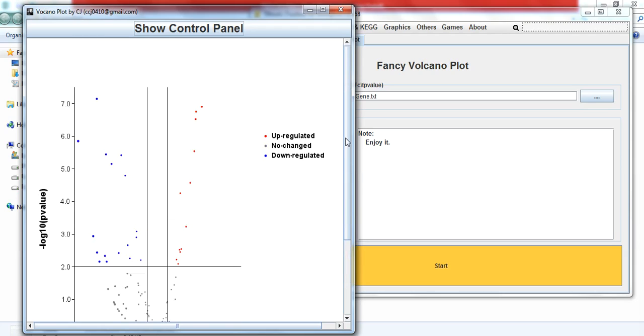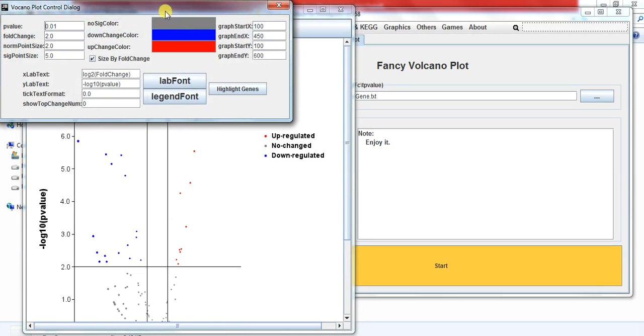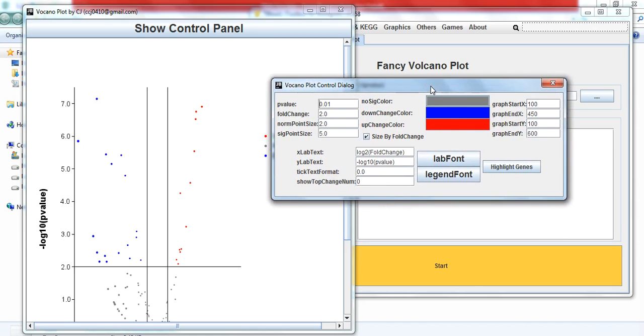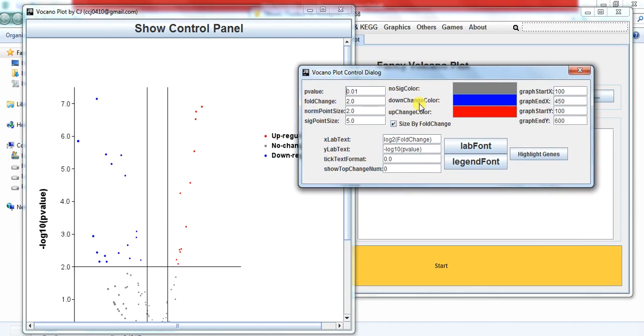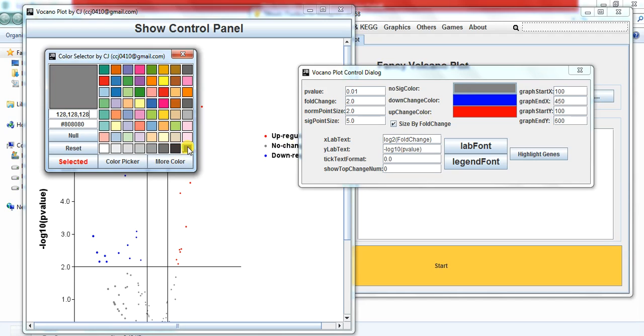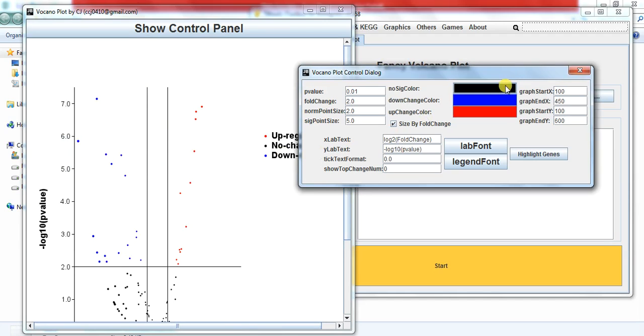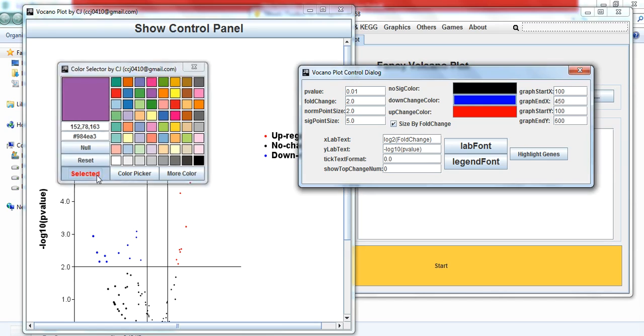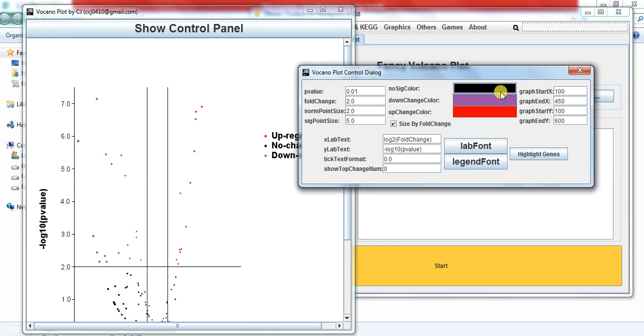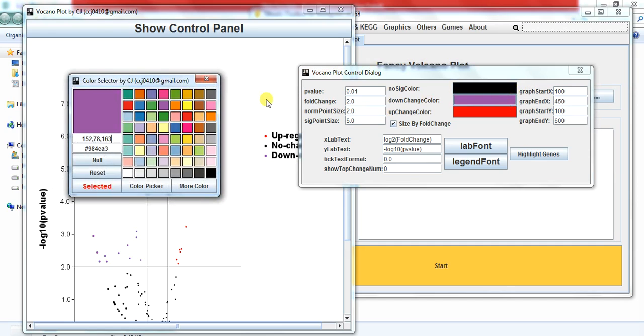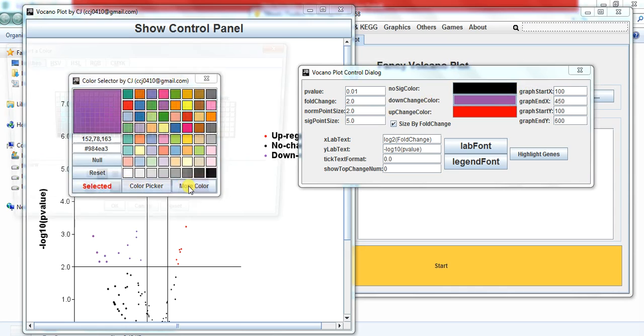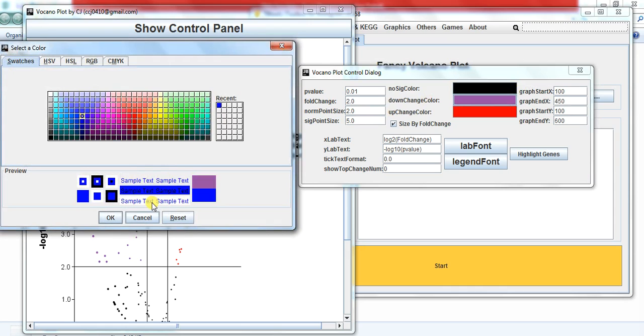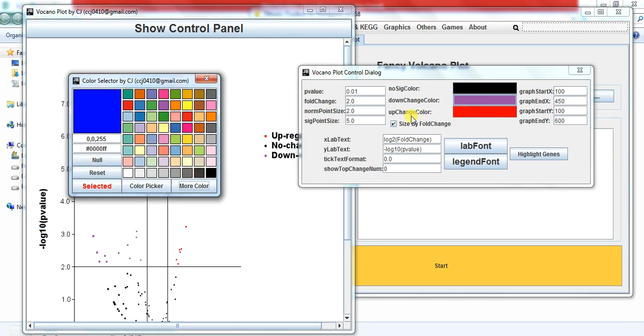So here show control panel, you can change the color of that gene that didn't change in response to stress like I give it to black color. Here you can change the color of your own choice.